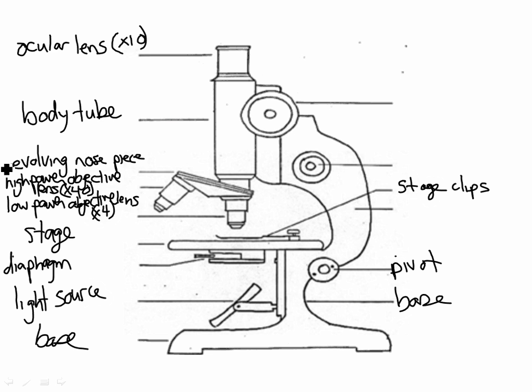All right. This guy's the arm, and when we carry it, we hang on by the arm and the base so we don't drop it. This guy is the fine adjustment knob. All right, the fine adjustment knob. If you want to spell it right, you got to say it right. And that moves it very little bit. We use that one when we're under medium and high power.